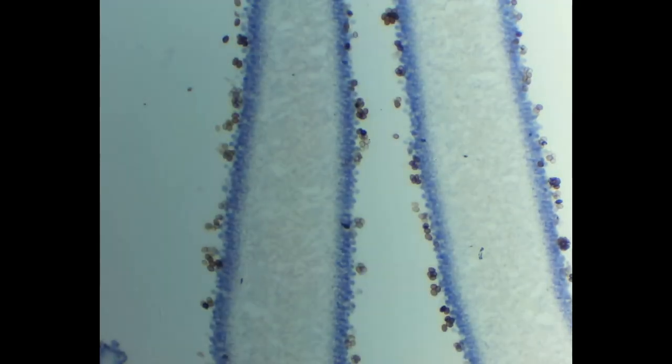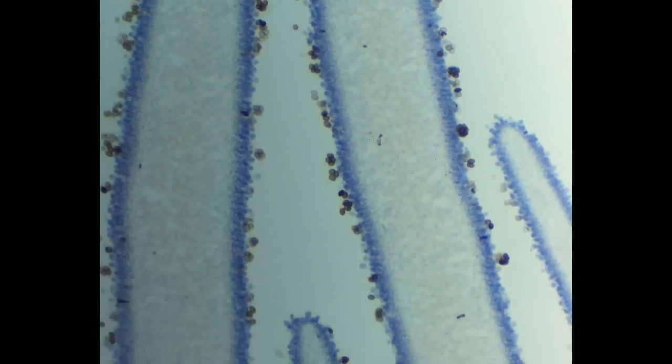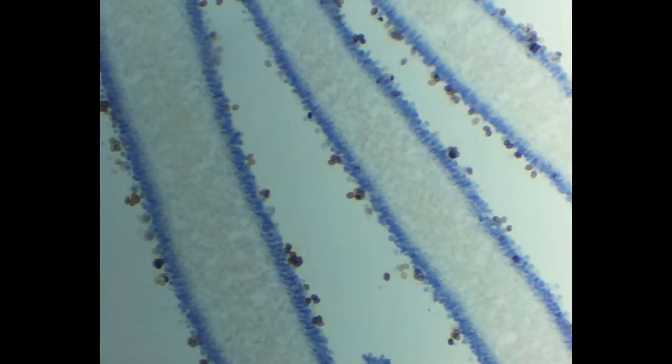If we zoom in, you can see these spores a bit better. That's how mushrooms propagate — it's by these spores.